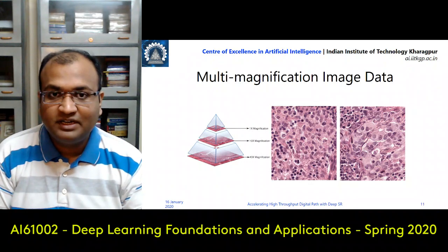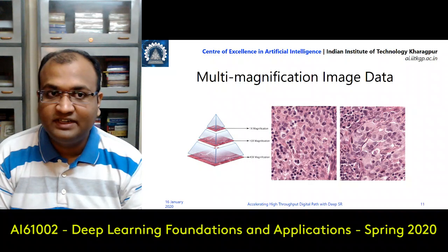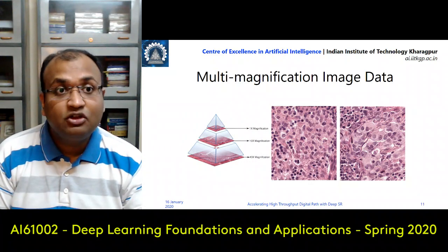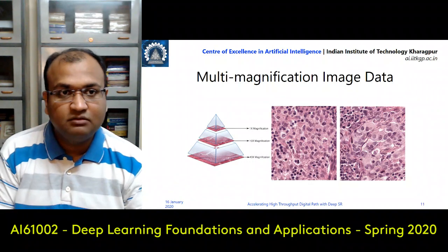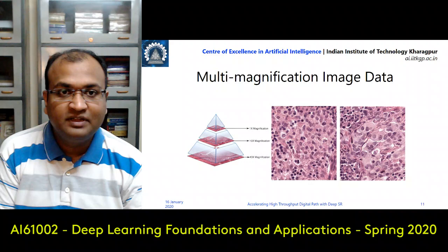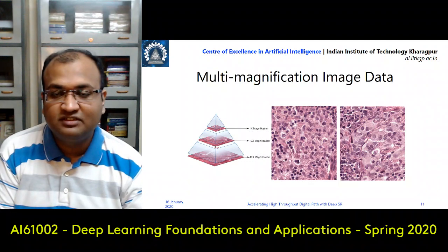so that's my downside. Now on the other side, what I can do is that I increase my magnification and then I can start acquiring. So now my data will increase, but I will also have a higher resolution, and then that's pretty intuitive over there. That my data will increase because I have a higher resolution, so it's resolvable. But then look at the other side of it.